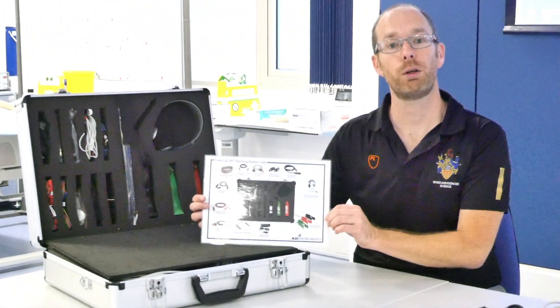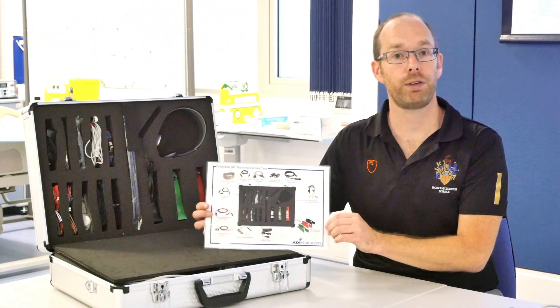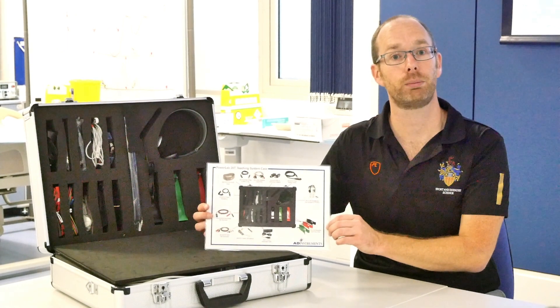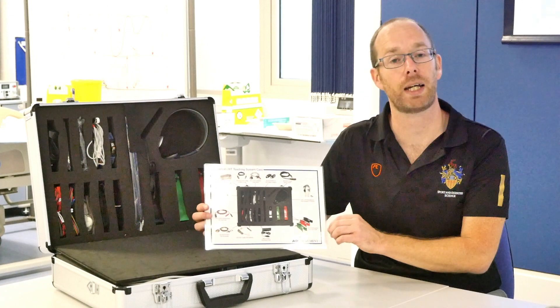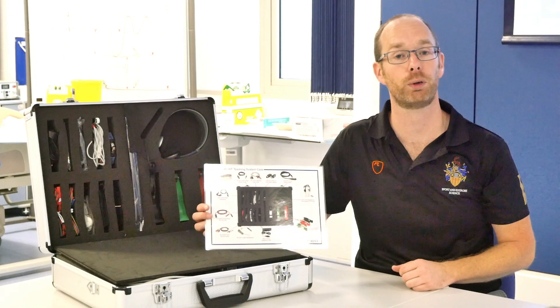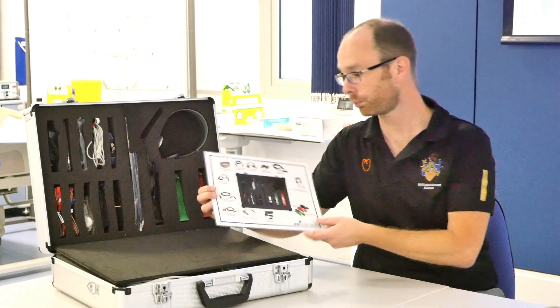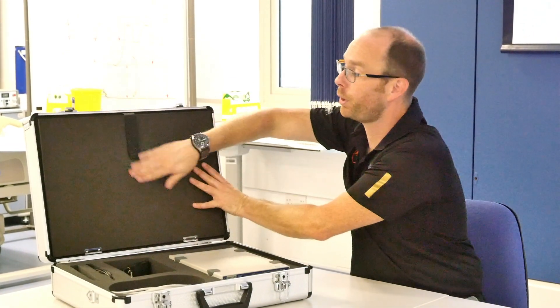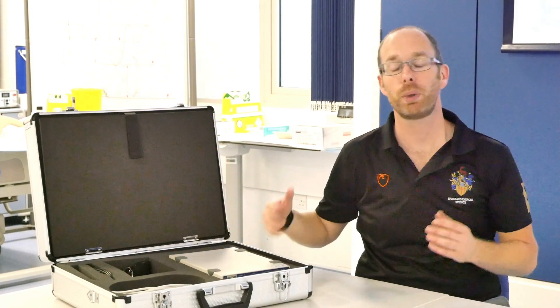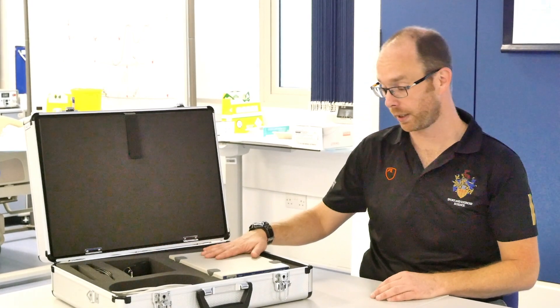There's also a sheet which gives you an indication of which parameters are in here, or which straps and leads, so you know which one to pick for each different practical. For most practicals we will already have set up the system for you, but sometimes you might have to take it out of the case yourself and select the correct leads. Whenever you need to do this, please be careful — this is a very expensive system and we don't want you to break it.